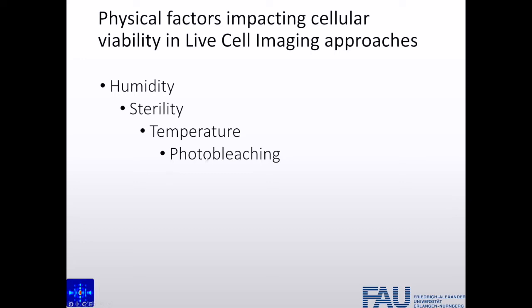So it's really good to have these new dyes which are coming up, which almost show no bleaching, and there's also fluorescent proteins with really nice stability and high intensity, which can be used. I show you some data about this. This is something you have to worry about when it comes to live cell imaging approaches.